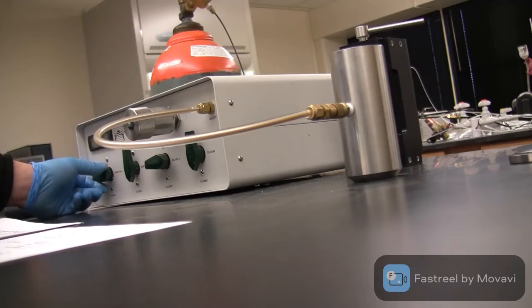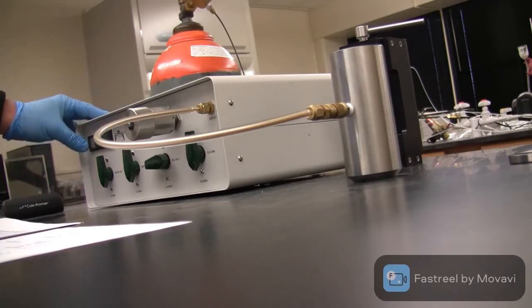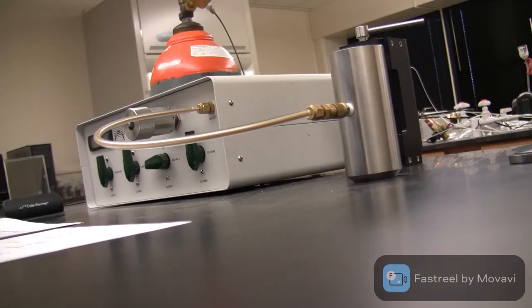Then we close the supply gas valve and see if this pressure decreases or is kept constant. In my case, we wait for 10 seconds. That should be enough. If the pressure is okay, it doesn't go down, that means there is no leakage. If it goes down, there is leakage. But in my case, as we can see, it's still 95.01 or 95, so it should be fine. So now we made sure there is no leakage.